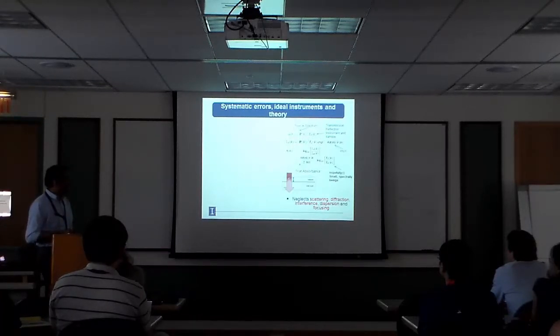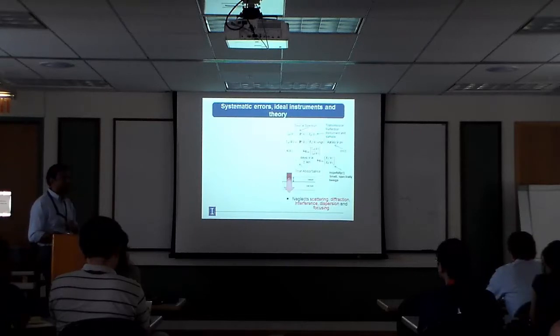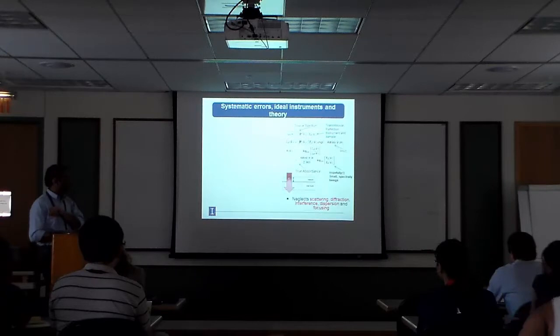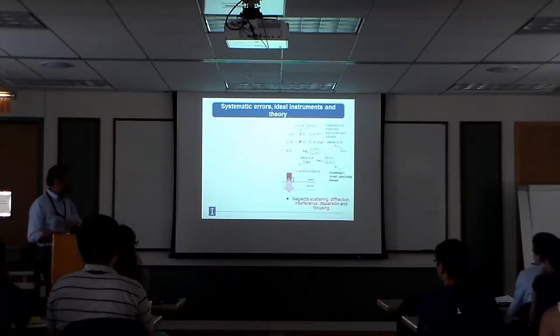So the way we're doing it is we take the intensity recorded by the detector without a sample first. So this is the electric field squared transmission of the instrument. It's basically mapping the source as transmitted by the instrument onto the detector, right? Intensity-wise. Great. Now, we put a sample in the path. And the only thing Beer's law tells you is that the sample absorbs light, which is an exponential decay in intensity, which is right here, this term, based on the path length of the sample, and this should be it, right? But there's also this transmission function that we have put in because of putting the sample in, which is not chemical, right? It's just perhaps scattering or whatever.